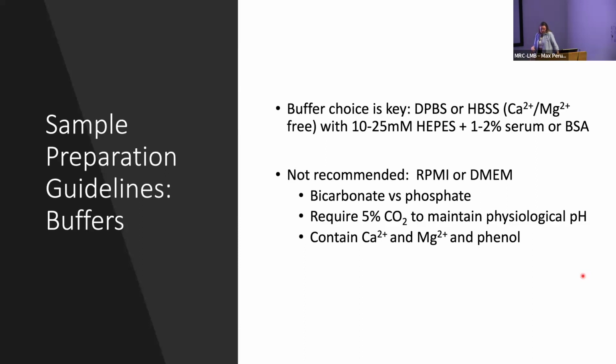And another prerequisite is to have a good single cell suspension so that, again, you're ensuring that when the cells are flowing through the core stream, we're also minimizing any kind of doublets. Those are two or more cells that are stuck together due to inappropriate sample prep.